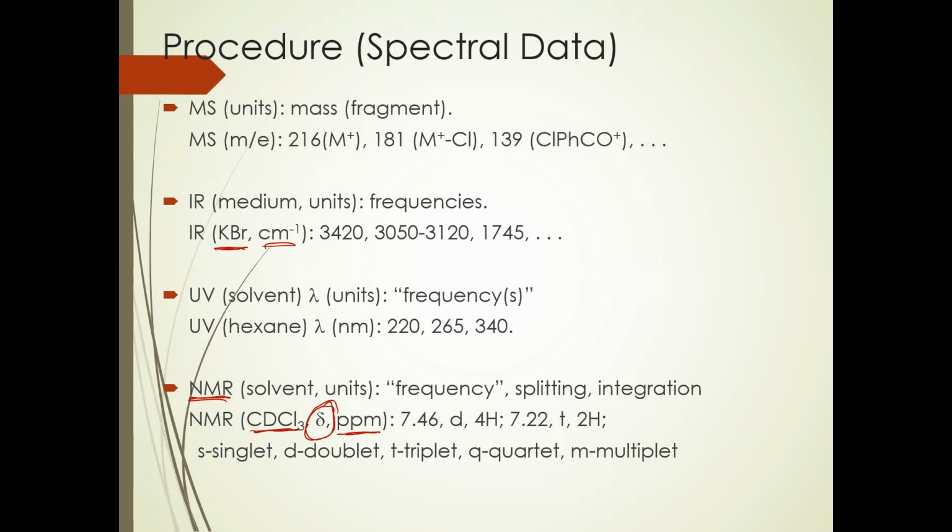And then after that, we give the chemical shift, the splitting, the integration, semicolon, chemical shift, splitting, integration. And you would do that for each of the peaks that's present in your spectrum. And the common abbreviations are given: S for singlet, D for doublet, T for triplet, Q for quartet, M for multiplet, and anything else you would spell out. So quintet, we would spell out rather than putting a Q, that's already taken. Likewise, sextet, septet, we already have the S reserved for singlet, so those you would spell out.